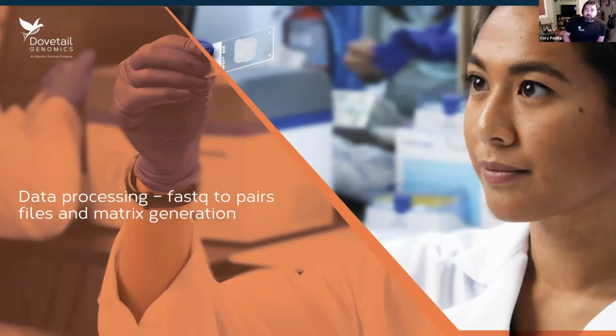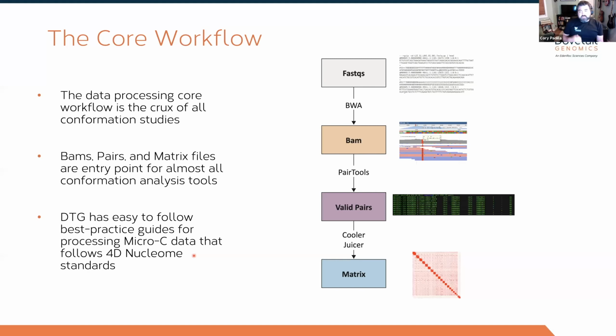All right, so you've sequenced the data. Now, what do you do with it? I'm going to walk you through the steps and what you do after you get your data back off the sequencer. So it's good to keep in mind really what the core workflow is that your data is going to follow. You're going to start with FASTQs. You're going to align with BWA-MEM to generate your BAM file. From there, we pipe this alignment directly into pairtools.